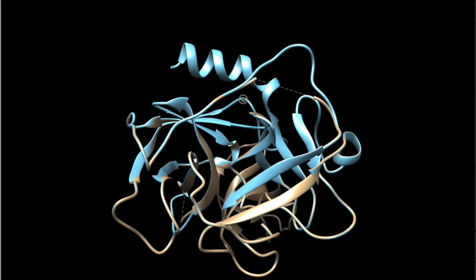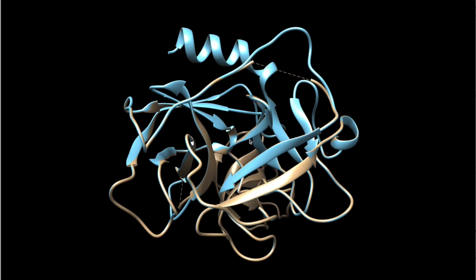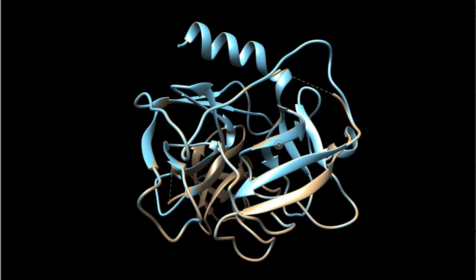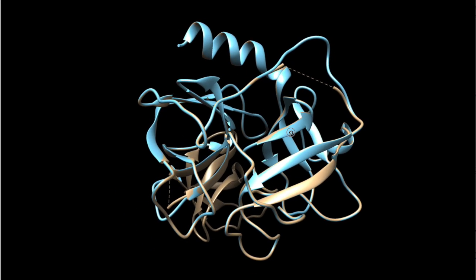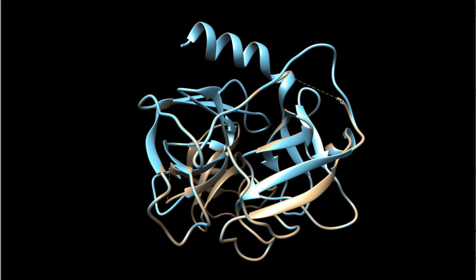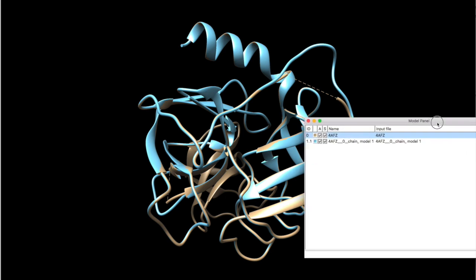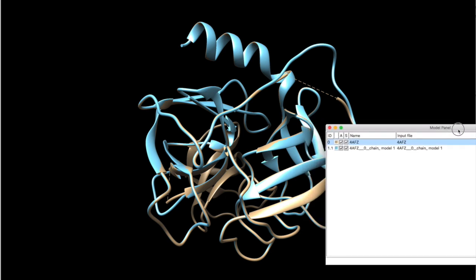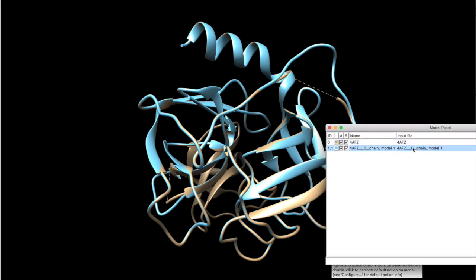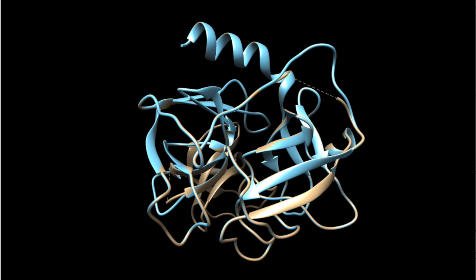This shows you the flexibility and the application of Modeler in fixing missing parts of the structures. Now, you can see here in the model panel that this model can be saved and PDB can be used for further analysis or modeling.